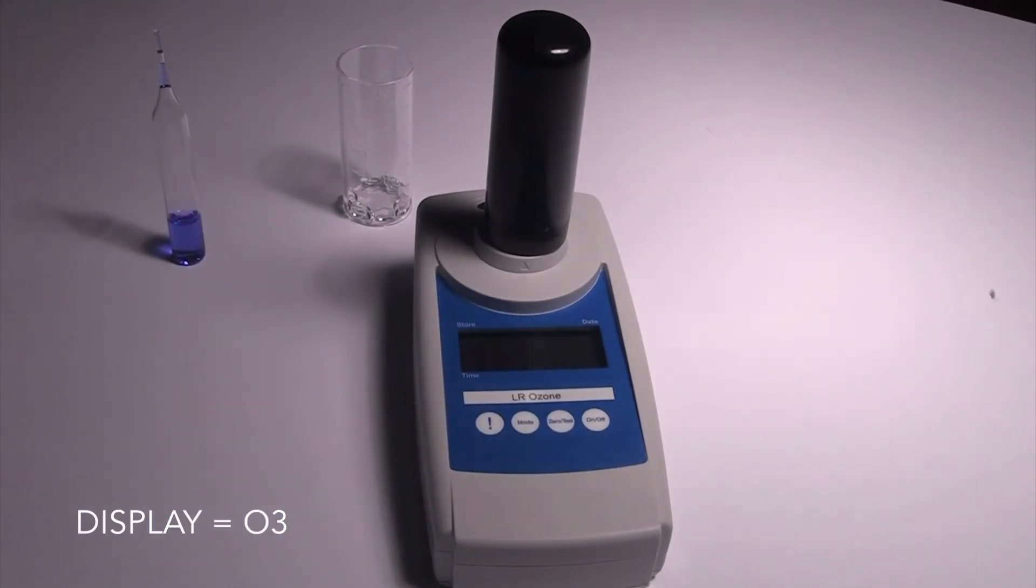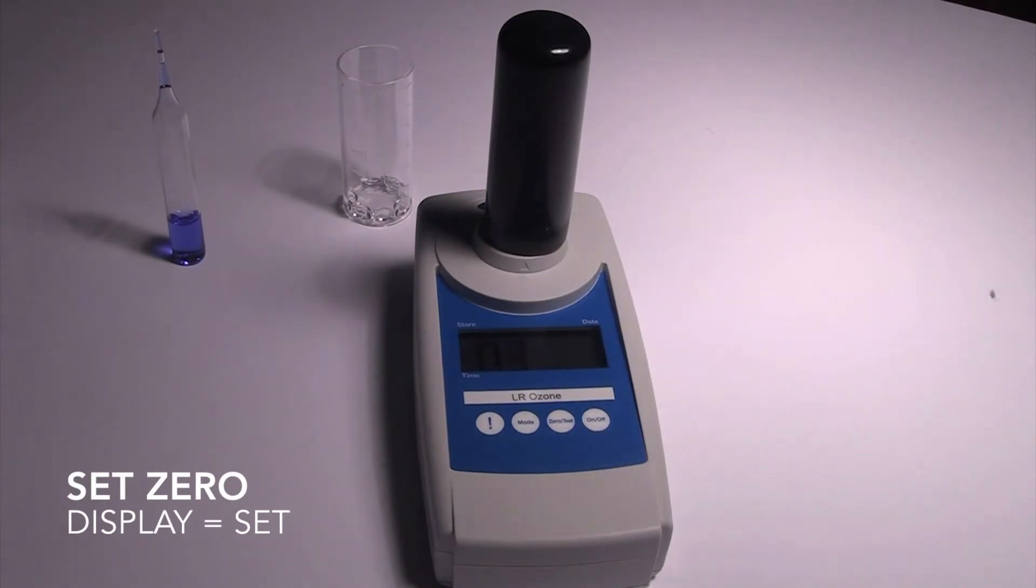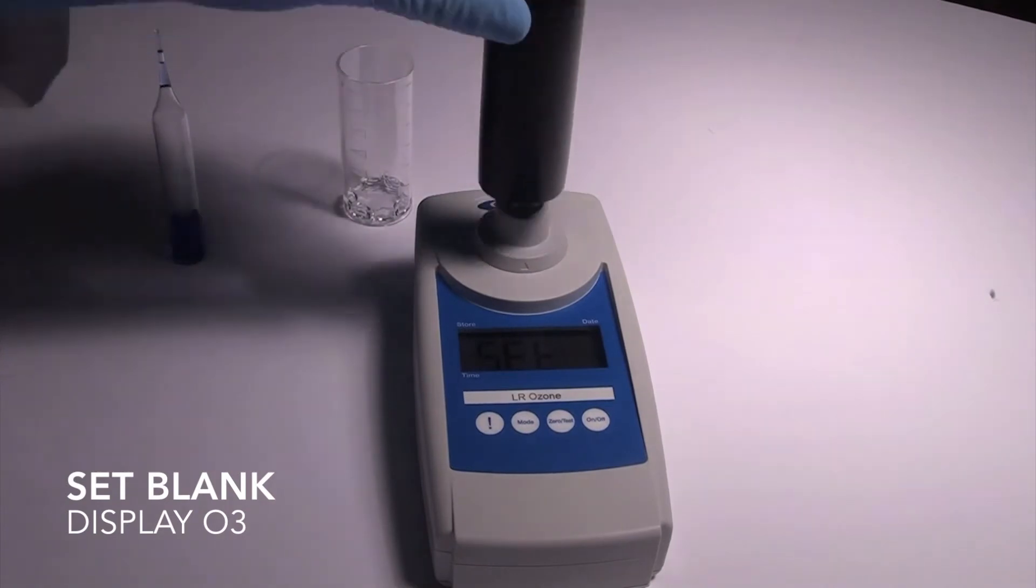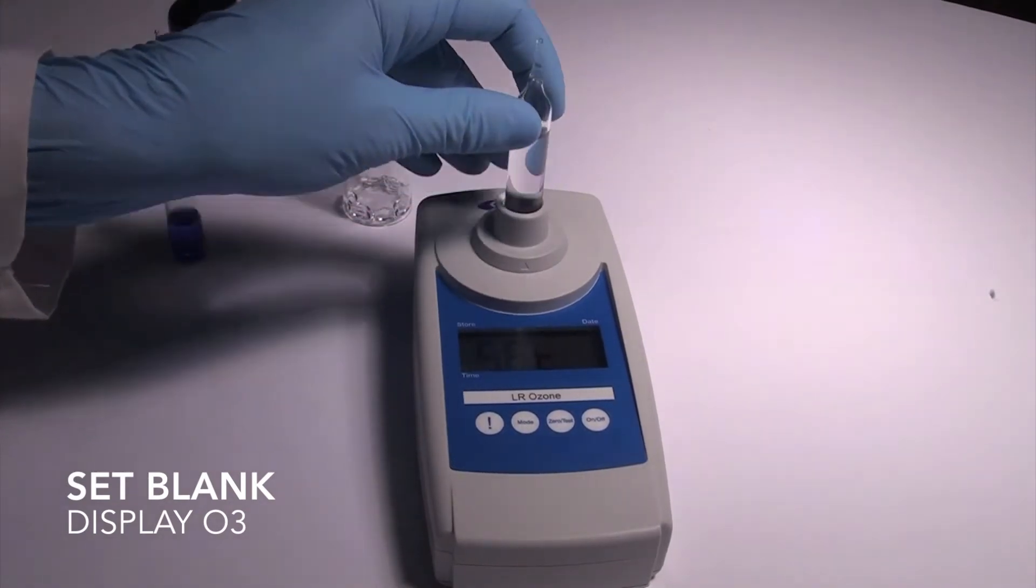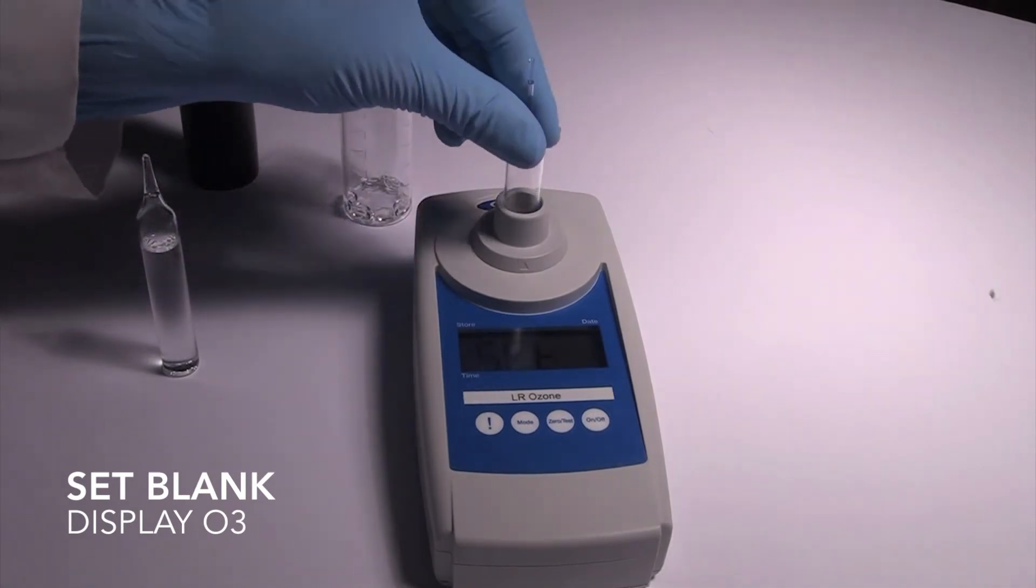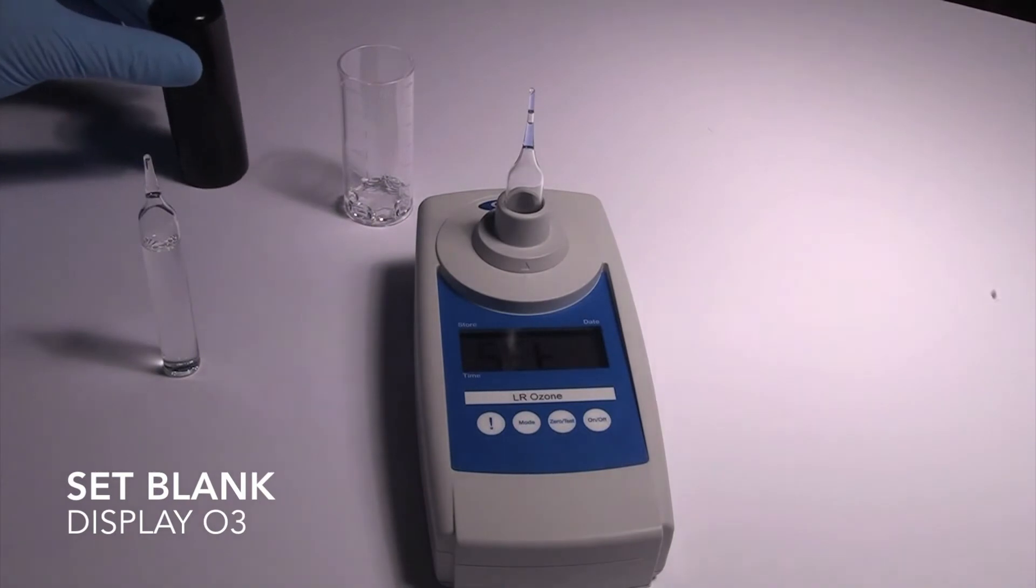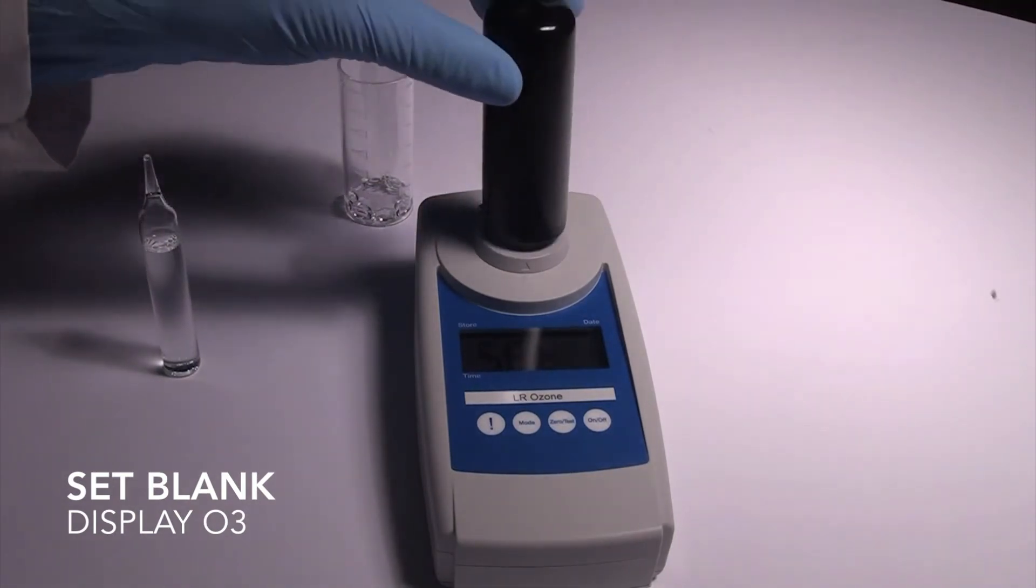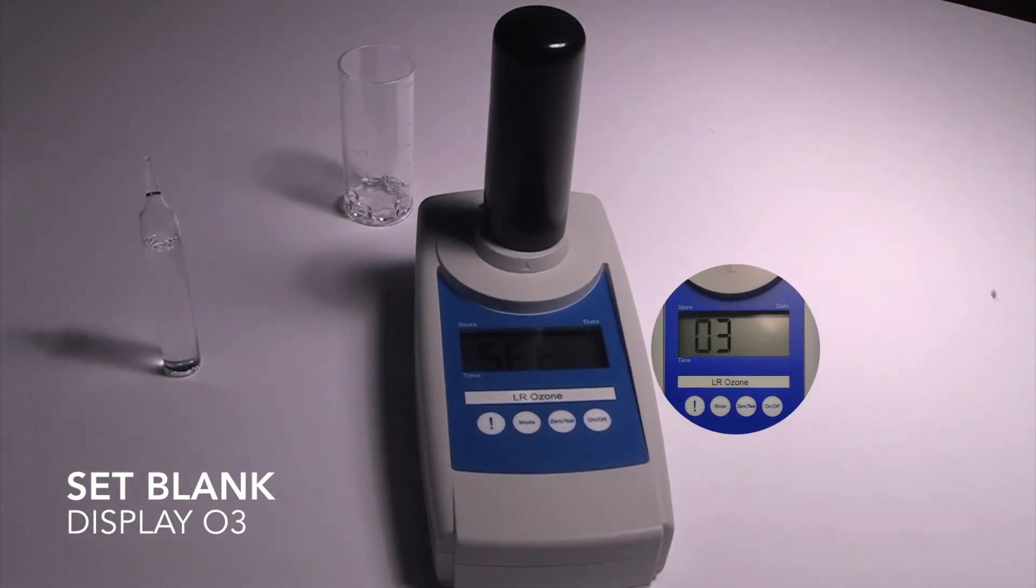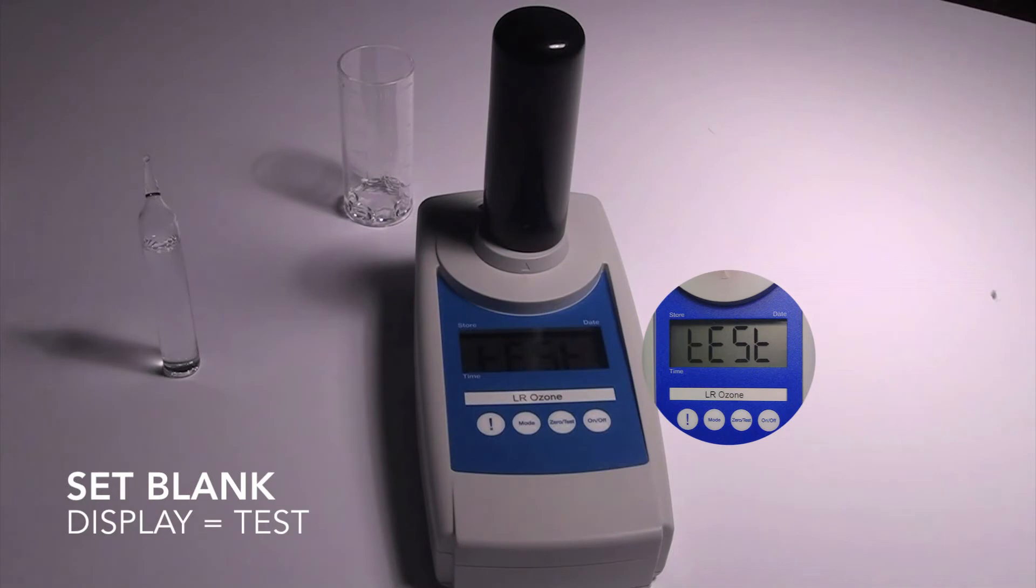The ozone symbol will flash for approximately 8 seconds, and then the display will show SET. Next, generate a reagent blank value. The SAM has now stored a reagent blank value for this ampoule.